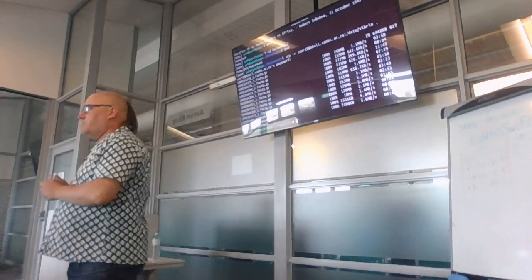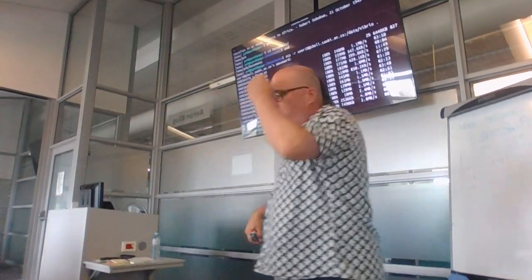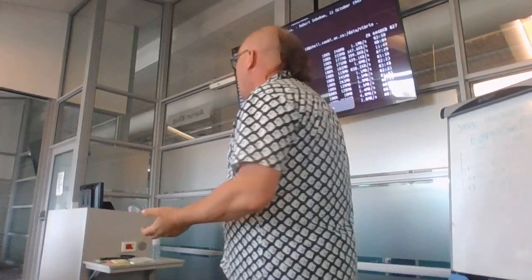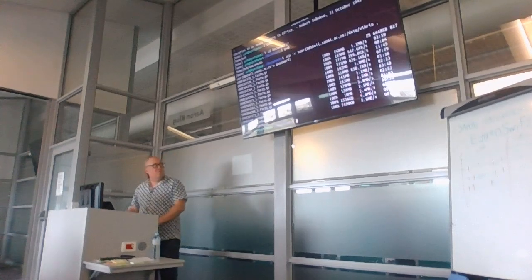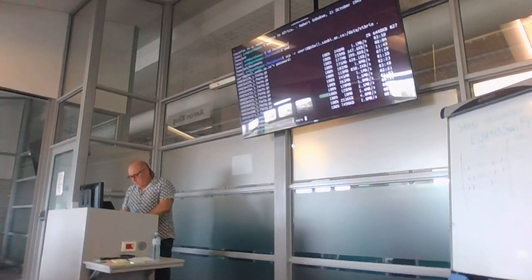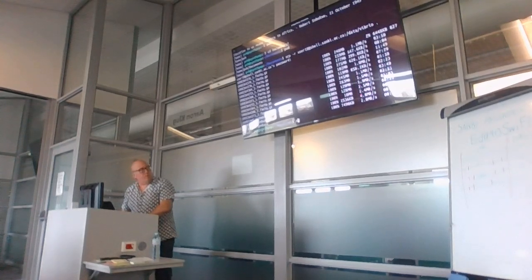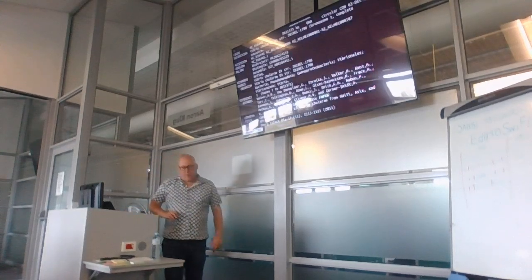Okay? Now, .genbank. Okay? What does .genbank mean? It means I got it from the NCBI GenBank database. Okay? And this is useful to me, and I will show you what we can see inside these files. These are not FASTA files. Sorry, I must go into the Vibrio folder and download it to here. These are not FASTA files.